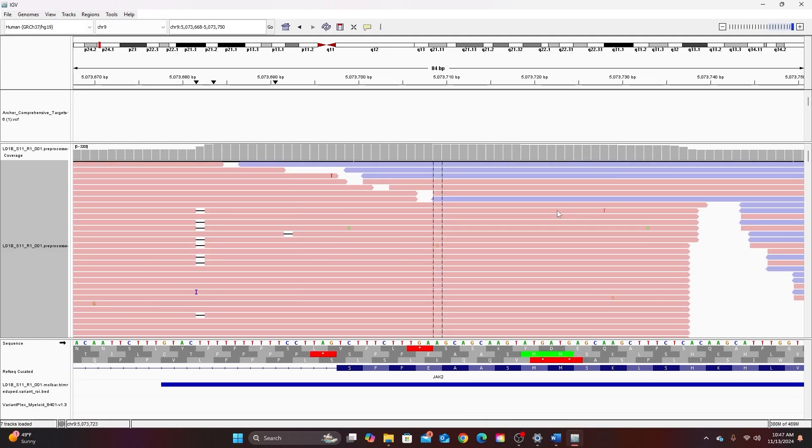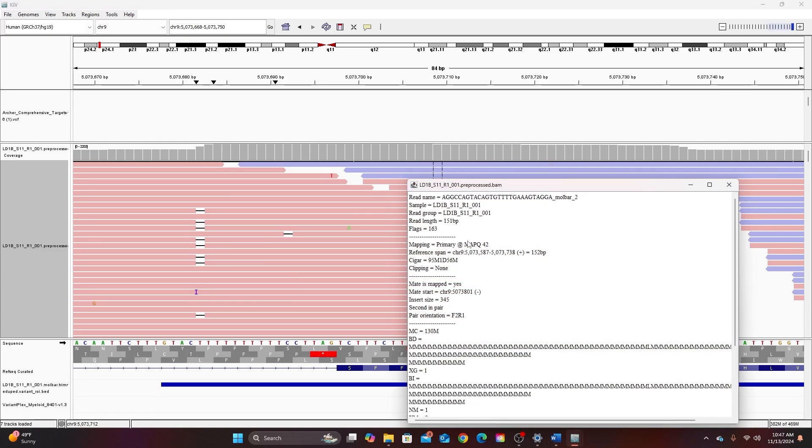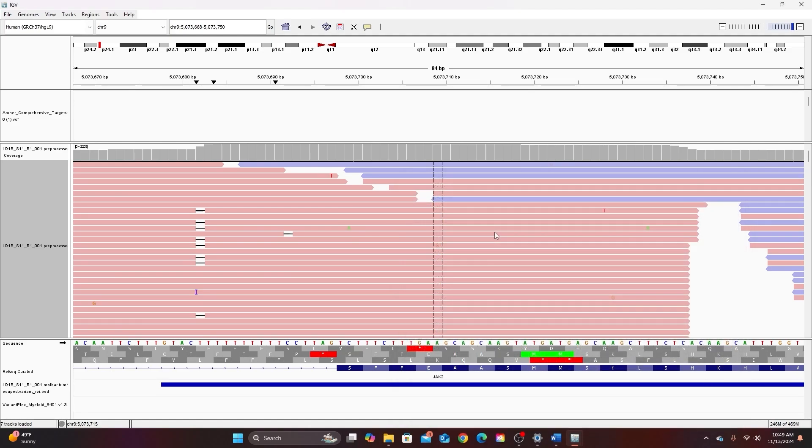You can see the features of each sequence by left clicking on that sequence. This gives you information about the length of that particular amplicon, quality scores, genomic positions, and whether this particular sequence was mapped to the positive strand or the negative strand.